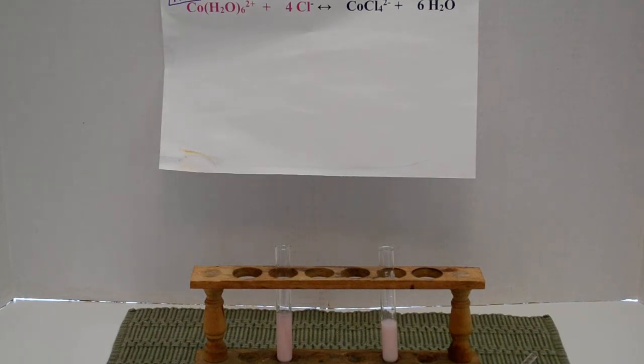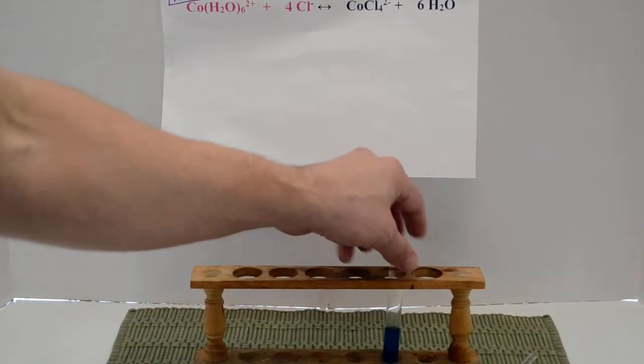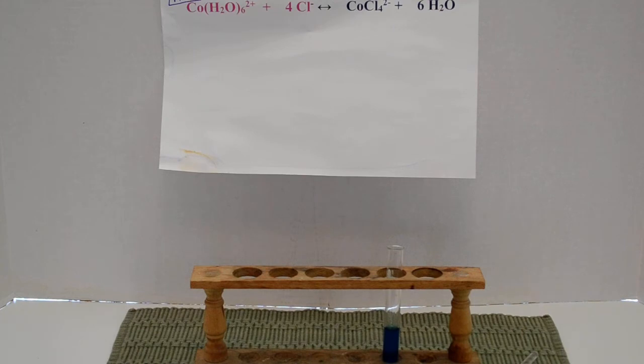Okay, a few more experiments going on here. Okay, assistant, I need the powder with the funnel, please. The powder with the funnel, please.